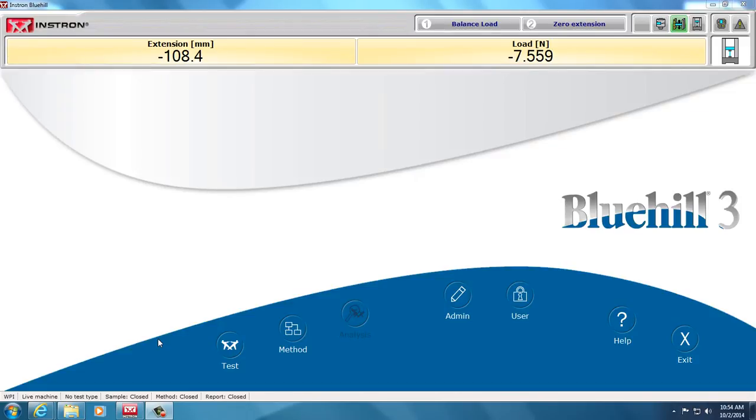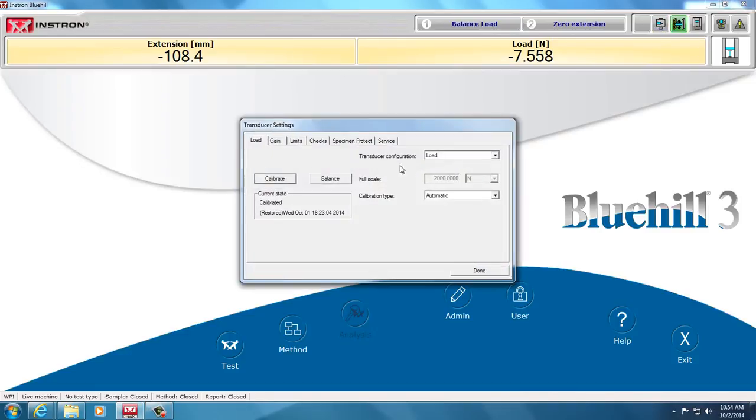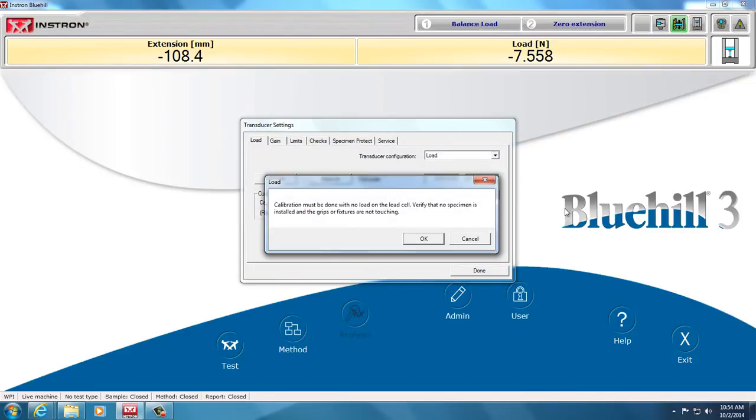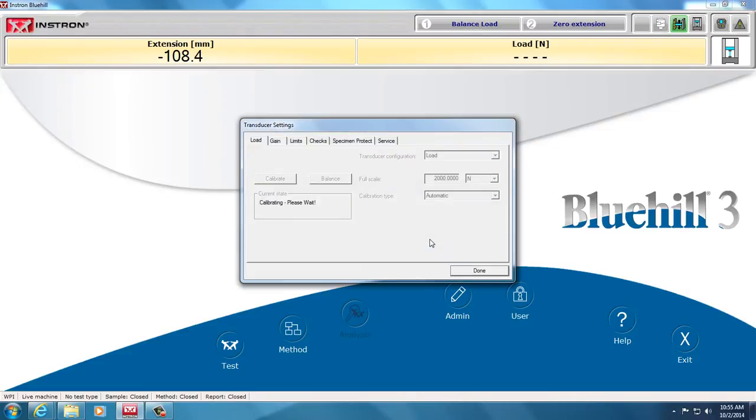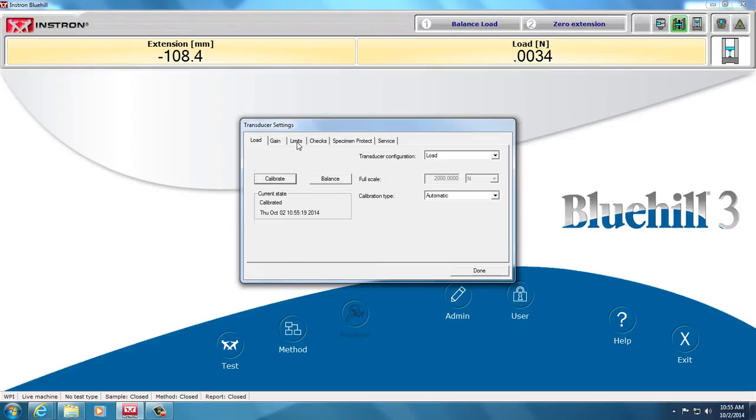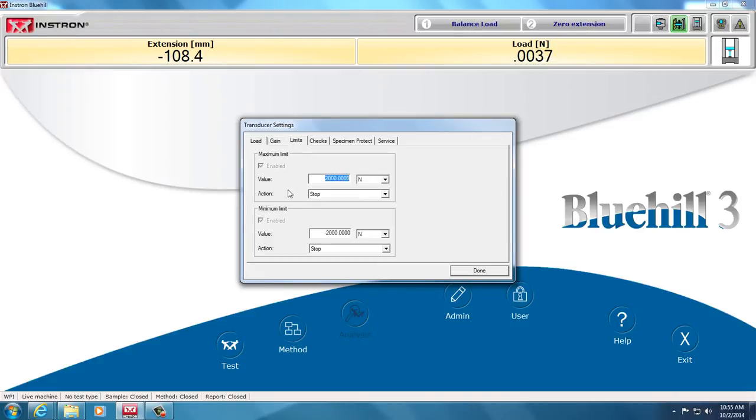So, the first thing you want to do, as with any test, is calibrate the force transducer. Make sure there's nothing on the load cell. Right now, the only thing I have is the upper anvil. Takes a few seconds. It electronically checks that the transducer is working well. It doesn't really calibrate the actual transducer physically, and you don't need to balance it, but I'll do it anyway here because it already balances it in that process. The limits are already set and enabled in this device.